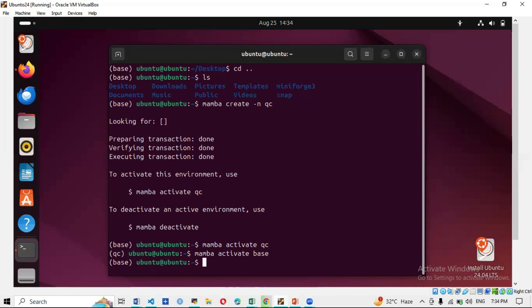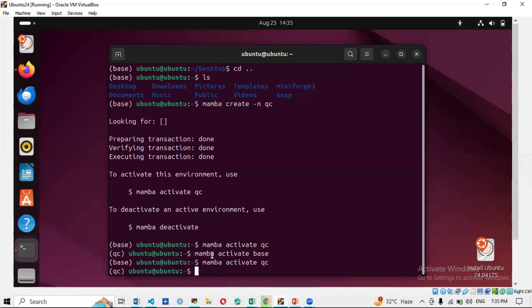If you're in the base environment and install FastQC there, it installs in base — which you don't want. You want it in the qc environment. So first activate 'mamba activate qc', then install there. Similarly, for alignment there's a STAR tool — create a 'star' environment and install STAR inside it. This separates tools from each other so you won't get confused.